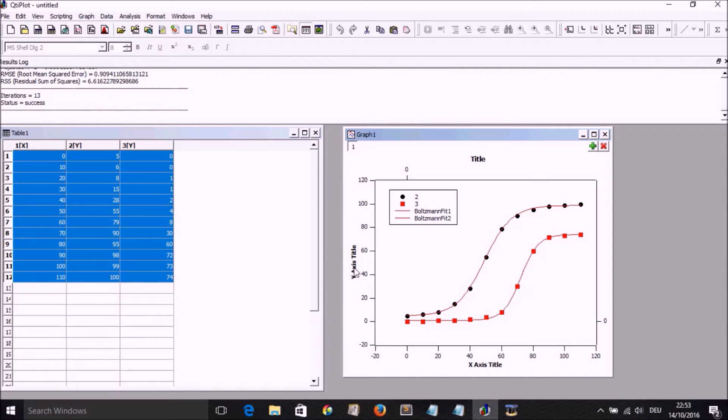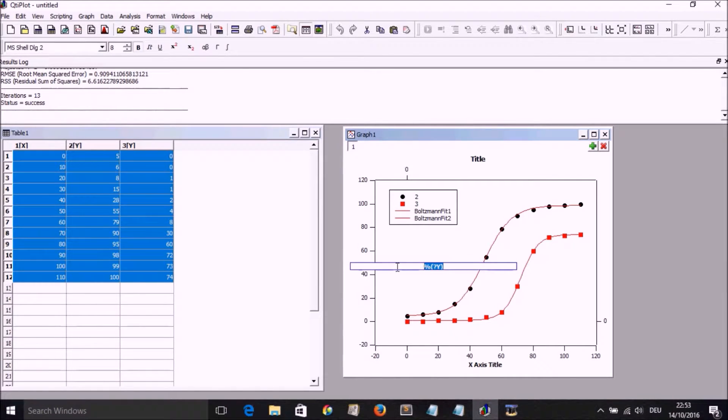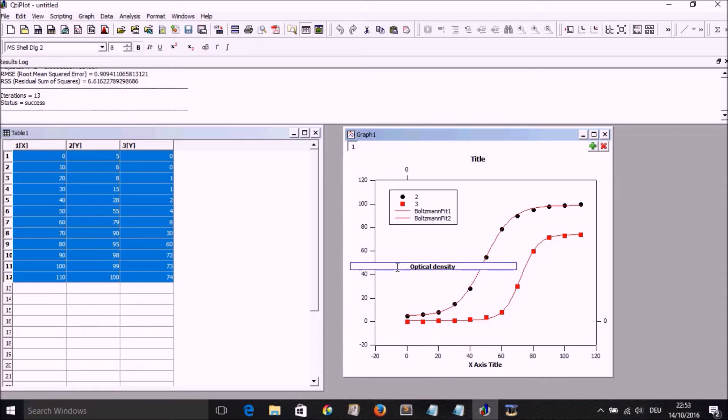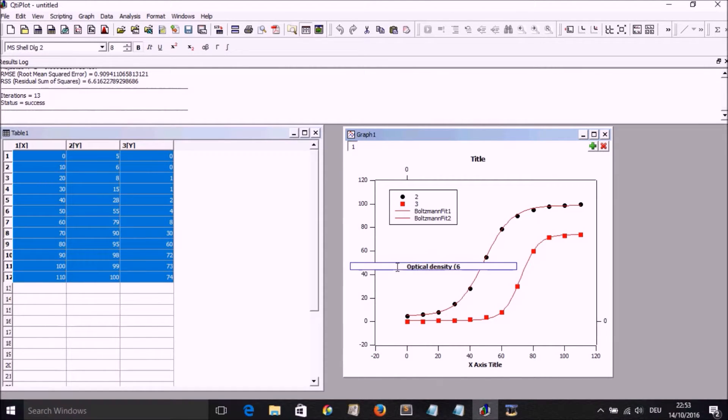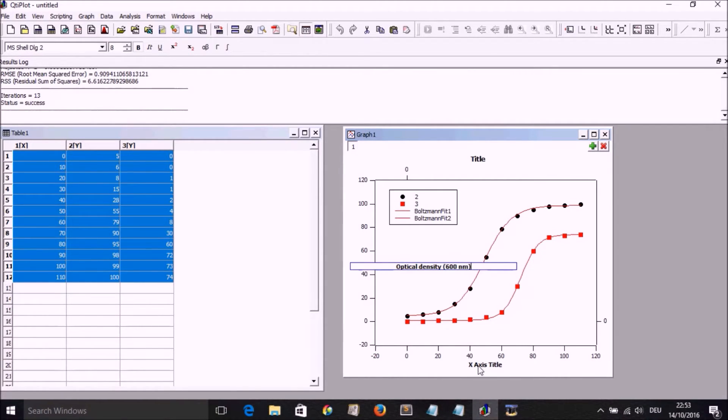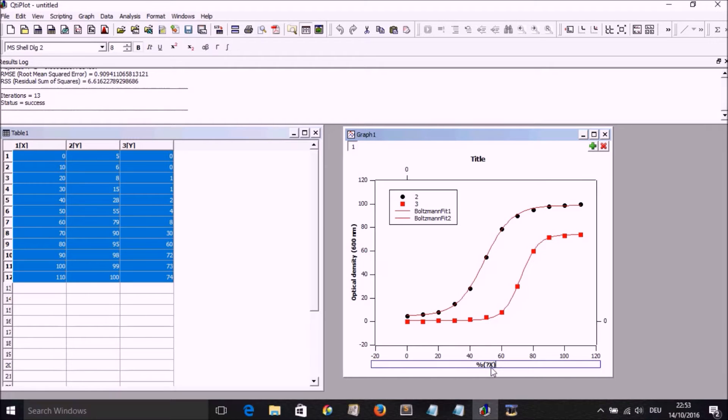And we can double click on the Y axis and write in whatever we want to write there. So imagine optical density and percentage. Let's say it's a percentage of a certain maximum. We write that.